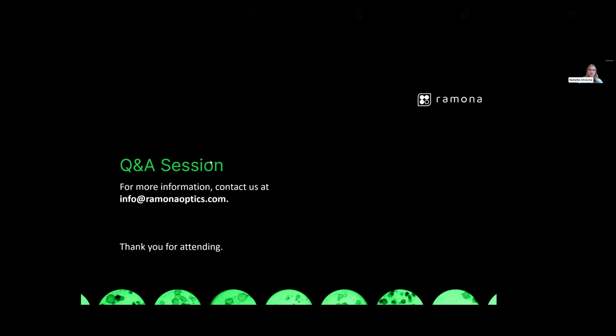So as a follow-up question to that, we have a question from Ian. He's interested in the hardware control. How does it work with synchronizing to external hardware components? Is it possible to make reactive events to biology, such as image analysis, trigger something like a fluidic pump kicking on? I think I can answer that quickly from my perspective at Ramona. Franz was a very early user of our technology, and so we developed that Python code for him. And now we've developed a very user-friendly web-based API that provides the ability for our clients to use their image analysis and capture and give you results at every time point, for example, in a time lapse.